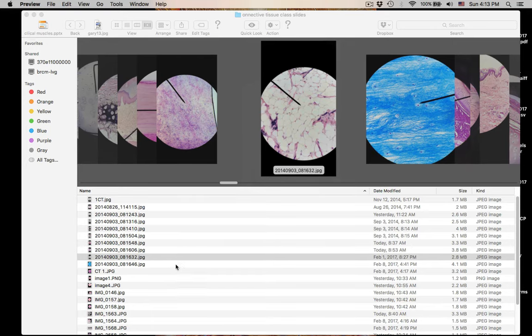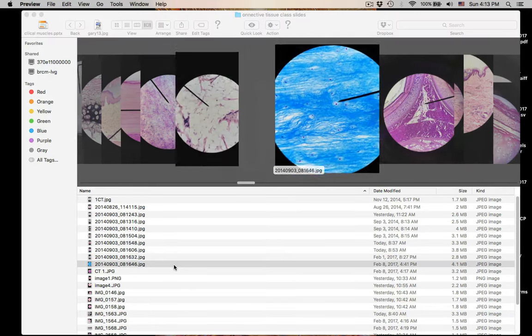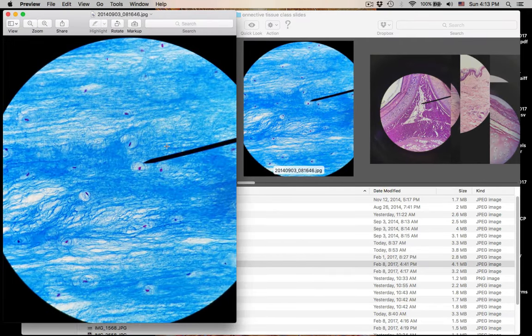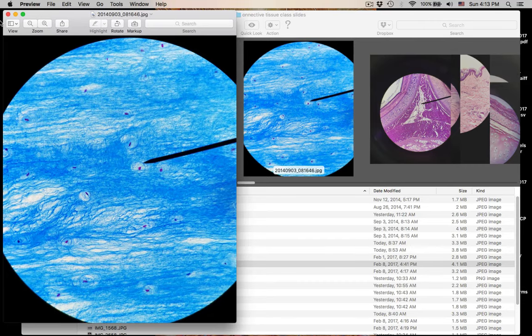Number ten is a cartilage — you can see the lacunae here. So this is fibrocartilage. The matrix is filled with collagen. This is fibrocartilage.